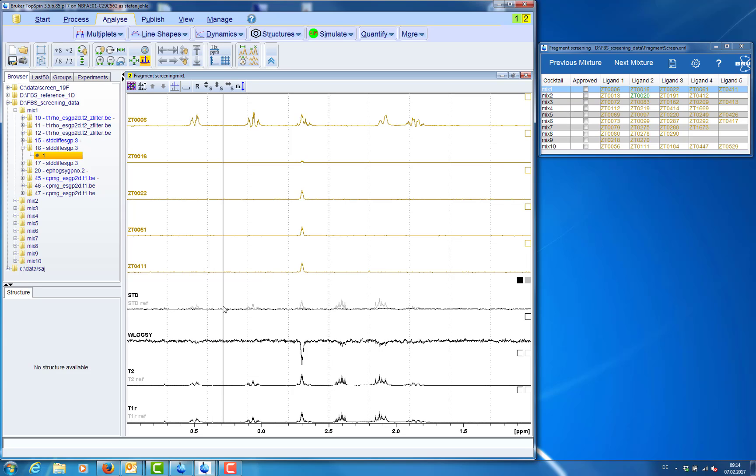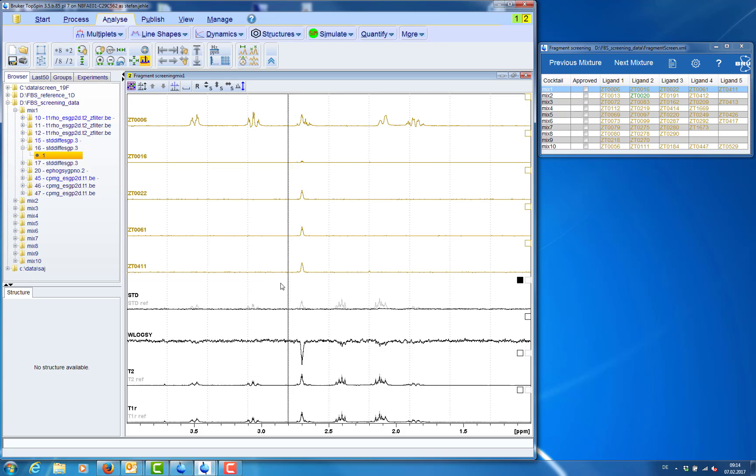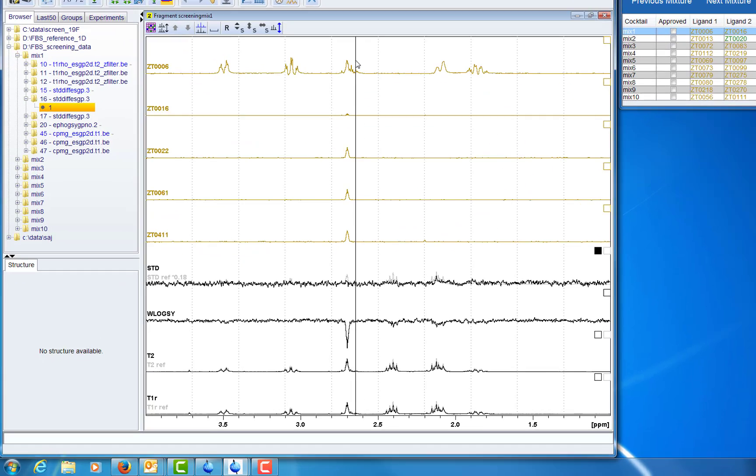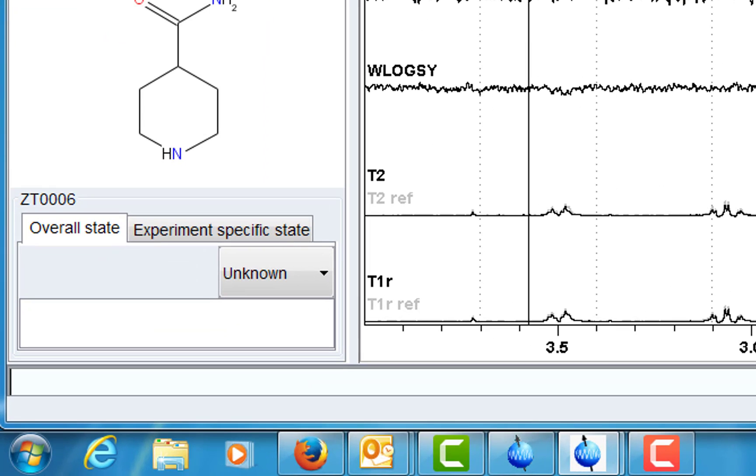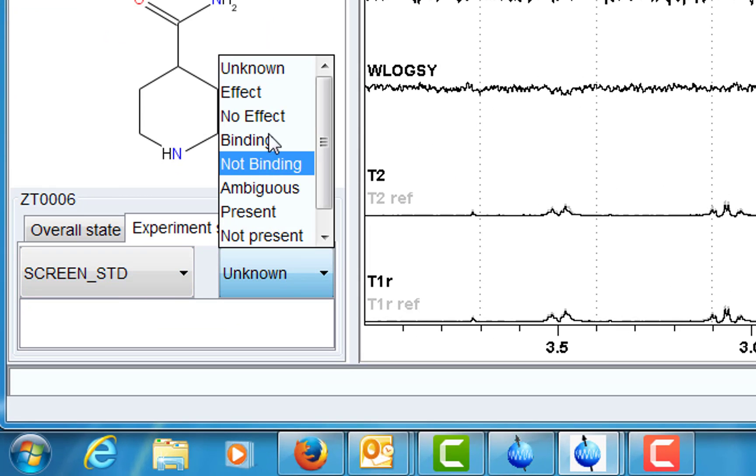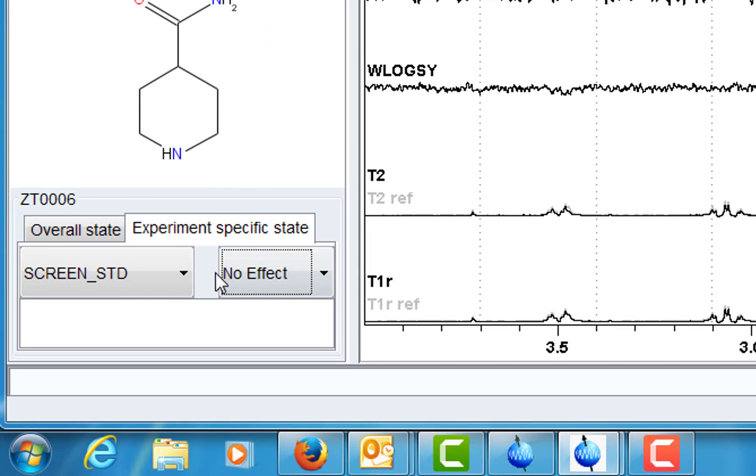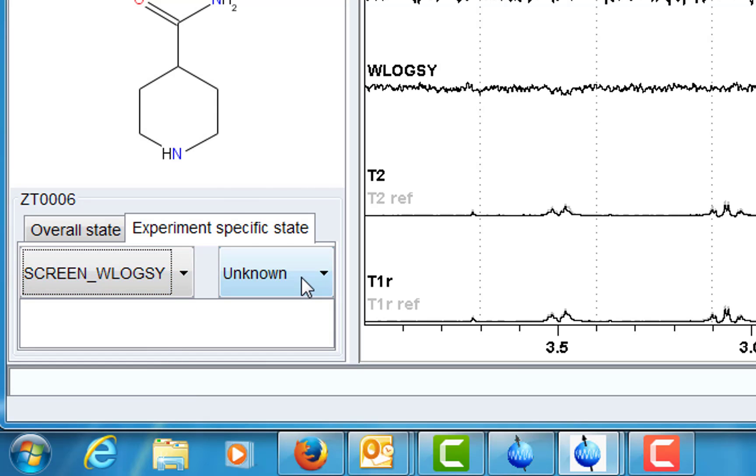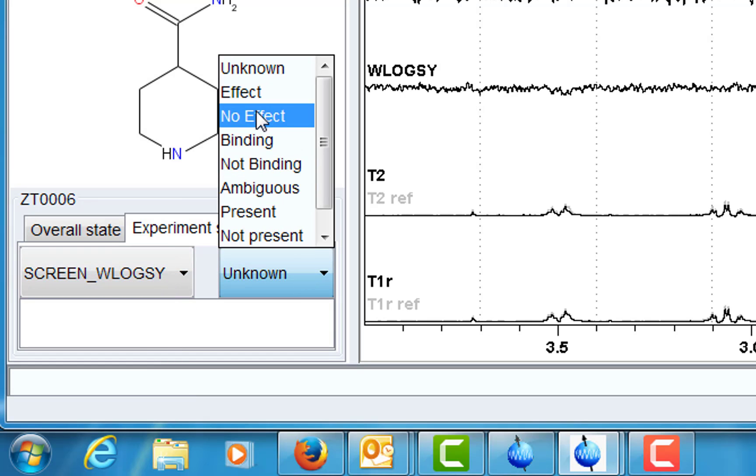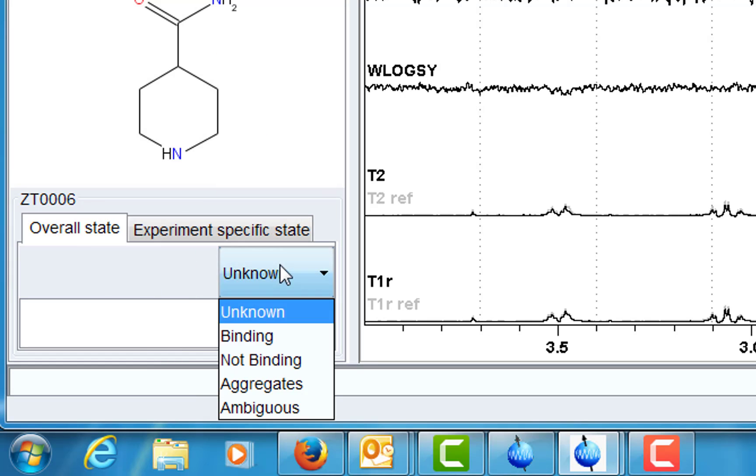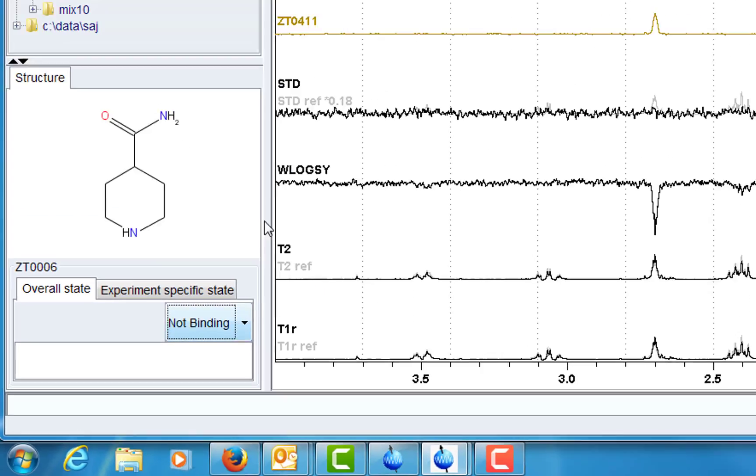But we can't really see any effect for this ligand there. So we make an annotation. And here the annotation would be no effect in STD. And there would be no effect in water LOXY. And the overall status would be not binding.